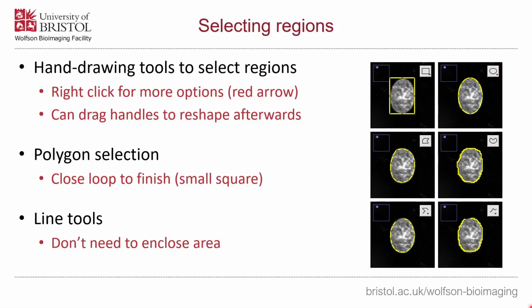So far we've looked at selecting subsets of the image in terms of substacks, but not of a single plane. Now that we've got that single plane showing the nuclei against a flat background, maybe we want to identify manually some of those nuclei. One reason for doing this is to get a rough estimate of how large the nuclei are, so that subsequently we can remove anything which is massively outside this range. So really small things that might correspond to noise, or really large things that are maybe clusters of nuclei that we can't accurately measure.